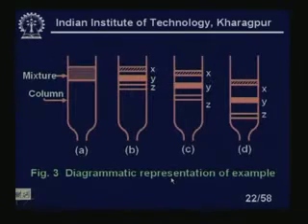You see here, in the mixture initially three gases are there. This is the time axis we are plotting: the x axis is the time, and the y axis is the separation between the three gases, that means as it elutes. As the time goes by, Z has the least affinity, so it is coming out fast. The separation means the time needed to come out of the column is more and more.